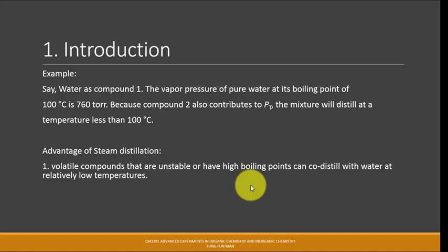Basically, if I spam a lot of heat at this compound, it will just split into various other products that we do not want. But with this process, the heating is a bit more gradual. It will first be converted into steam, the vapor phase, and then after that you can get back the original compound intact. You won't be decomposing it, breaking the covalent bonds or so whatsoever.